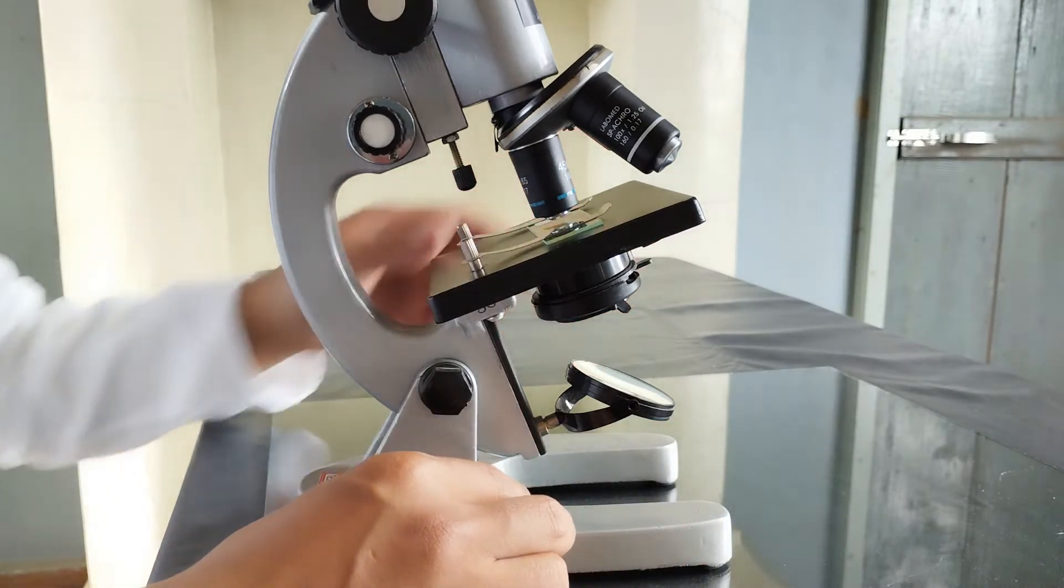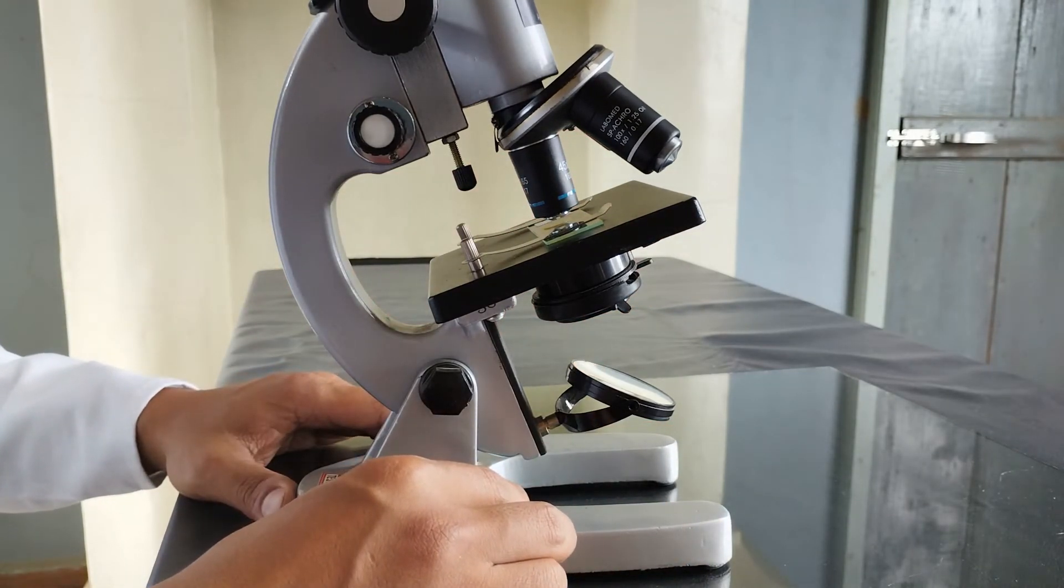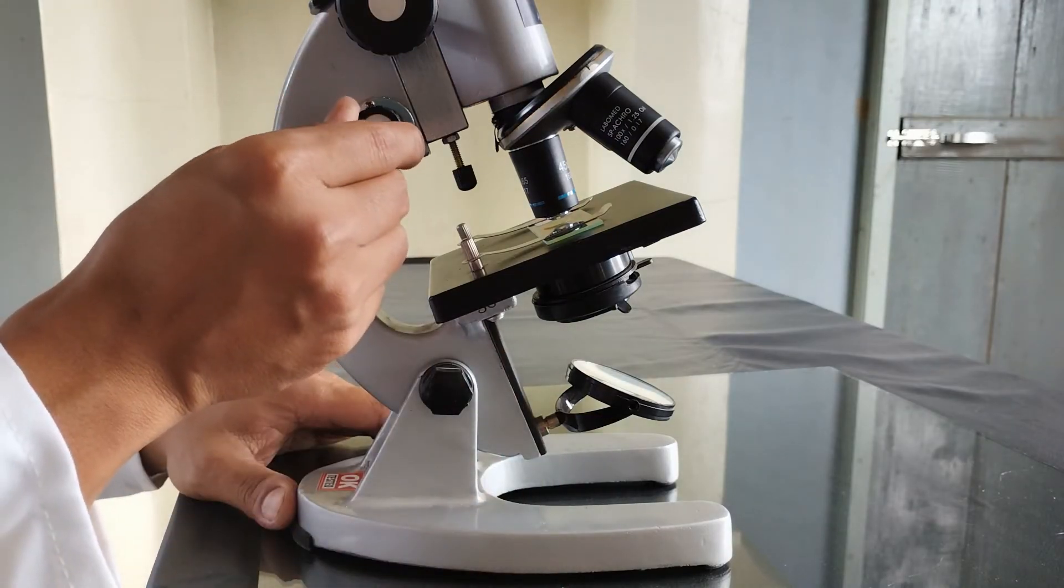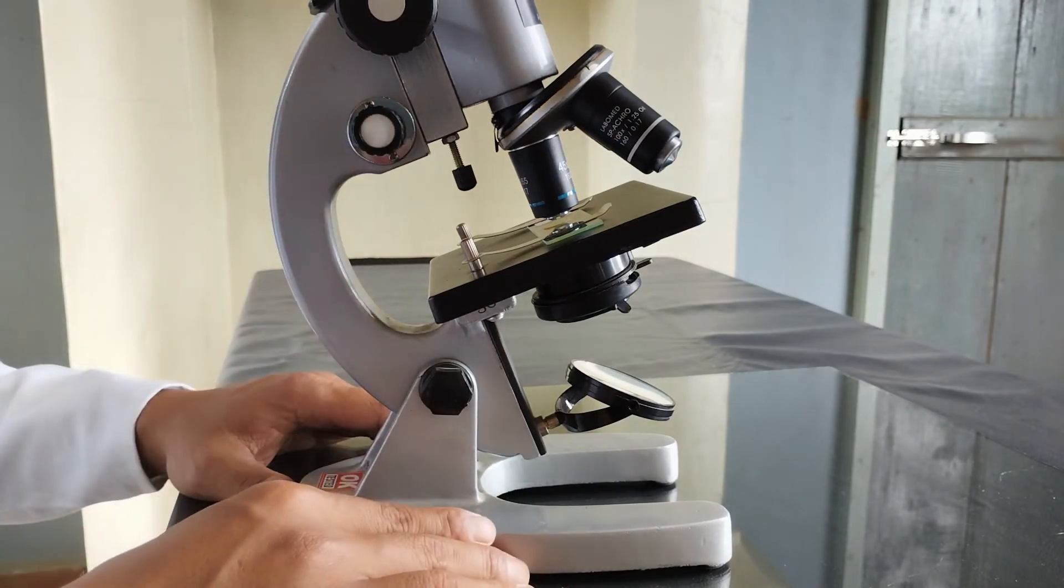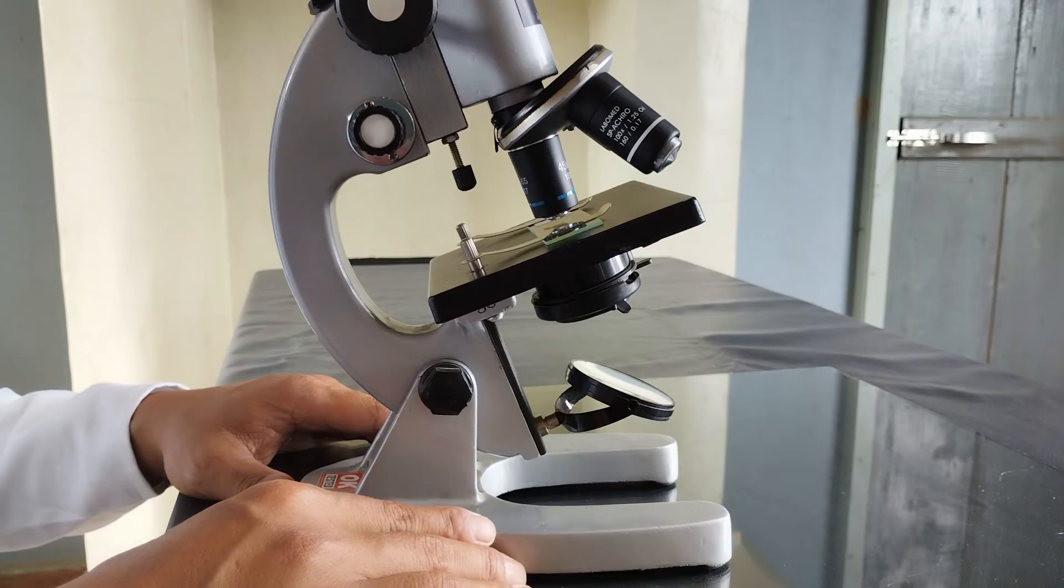More advanced brightfield microscope models come with a par-focal design feature whereby the image once focused under low power will remain in focus under high power lenses as well without the need for refocusing.